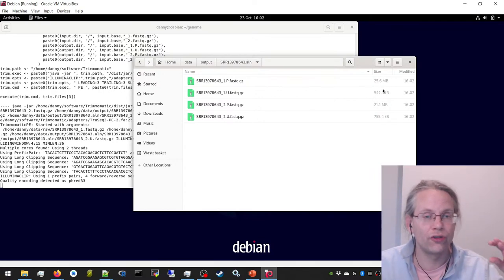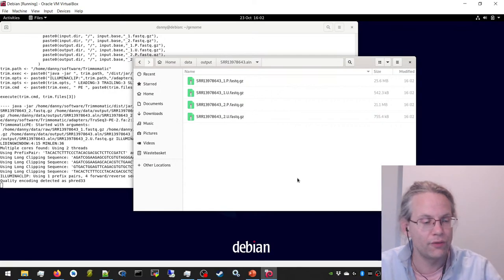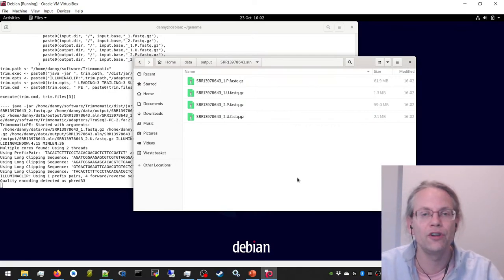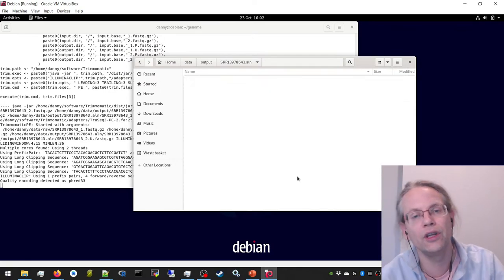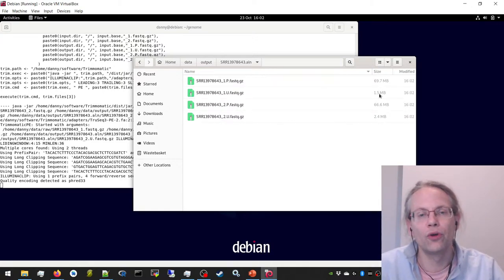It just takes 2 reads, one from the left, one from the right side, analyzes them, and then puts the reads into the corresponding files. So if we press F5 a couple of times, we can see these files growing. You can see that it discarded a lot more of the right reads, right? Almost double the right reads were discarded compared to the left reads.